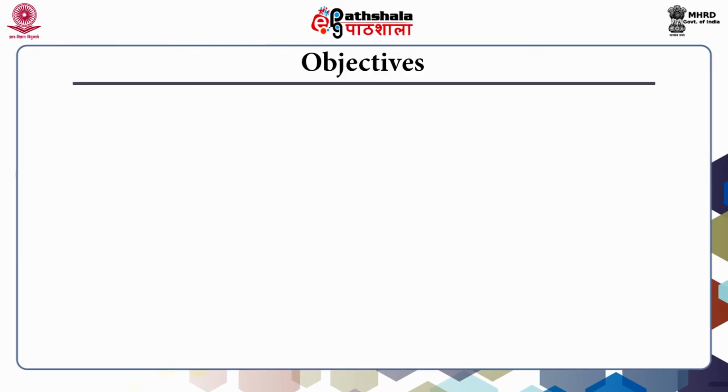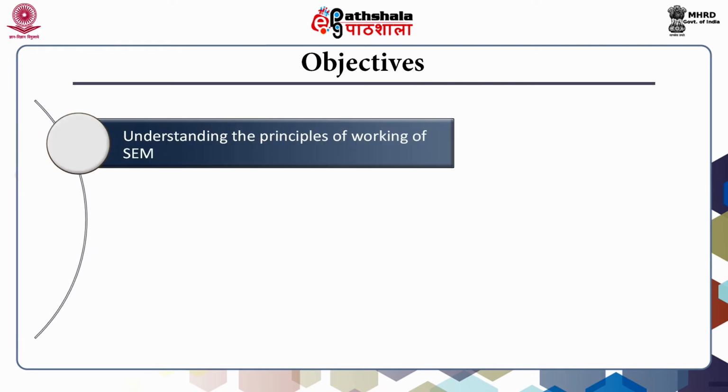Dear students, in today's lecture, we will focus on understanding a very important and critical microscopic technique, that is scanning electron microscopy. It is popularly referred to as SEM.